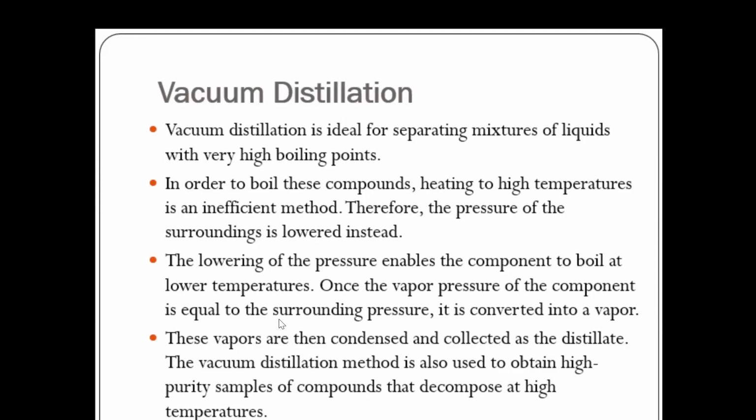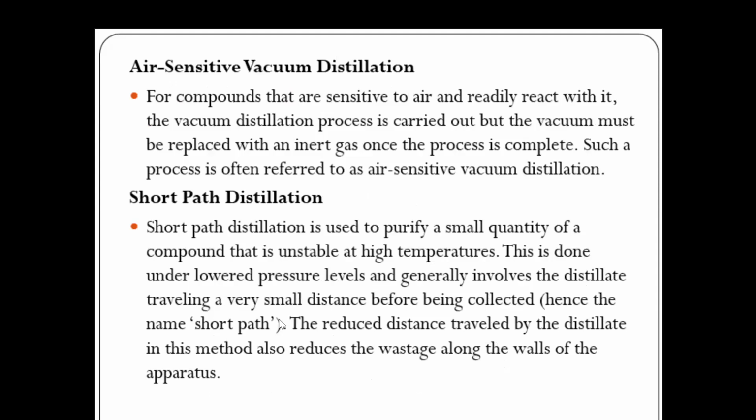So in this, vacuum is provided. Air sensitive vacuum distillation. What is the meaning of this? It is for compounds that are sensitive to air and readily react with it.